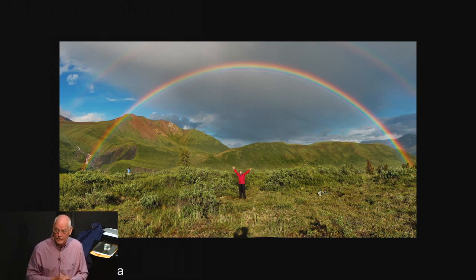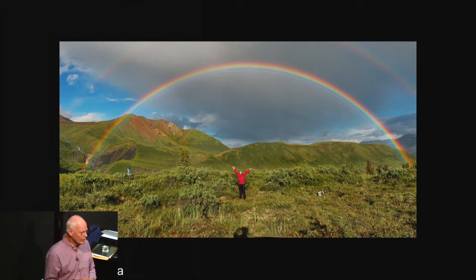Fluorescence imaging gives you molecular specificity because these labels only bind to actin. And if you see filaments that light up in fluorescence imaging, this must be actin, or microtubules, or a membrane protein, because the binding is molecularly specific.